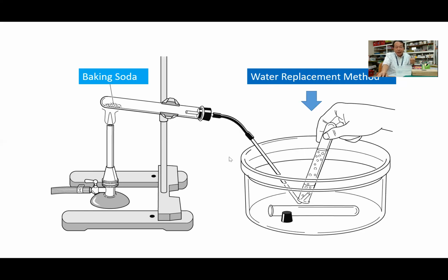Okay, but it's very quality experiment apparatus. Sometimes it's very difficult to get this quality experiment apparatus. So today we are using very local and very common materials. We can get them at home. Generally speaking, in rural areas, it is very difficult to get this quality apparatus. But we don't have to give up. We can use very low cost and very daily materials. Okay, let me show you.